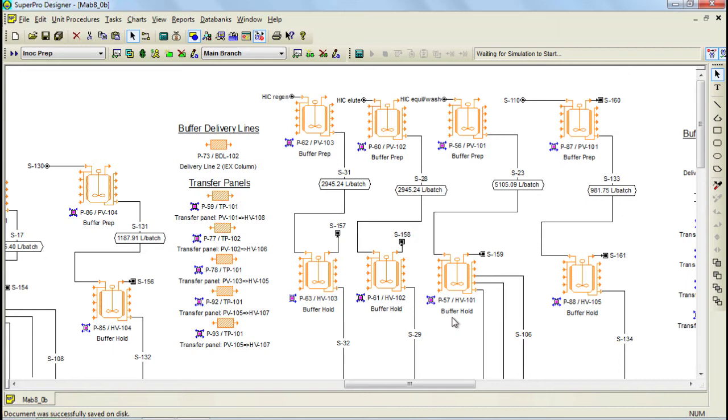In this model, four buffer delivery lines have been specified. These lines are dedicated to supplying buffers to the various chromatography columns and the diafiltration systems. The way to simulate the occupancy of the transfer panels and buffer delivery lines will be described later in this video.